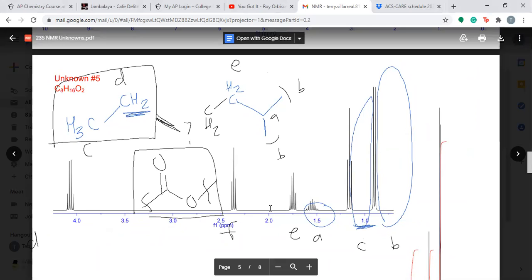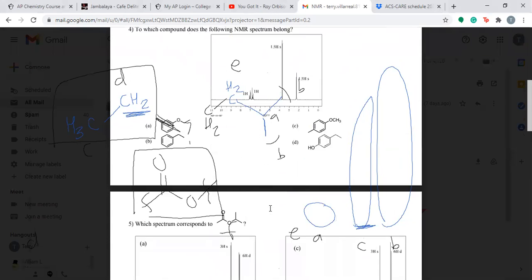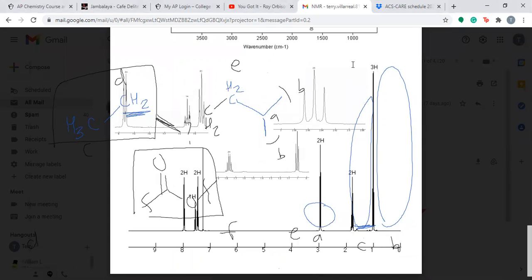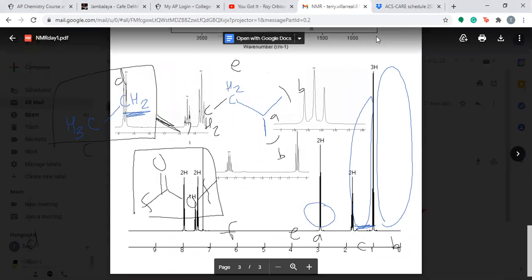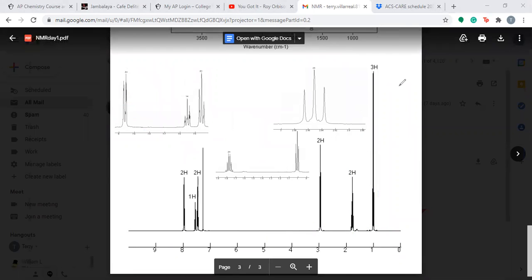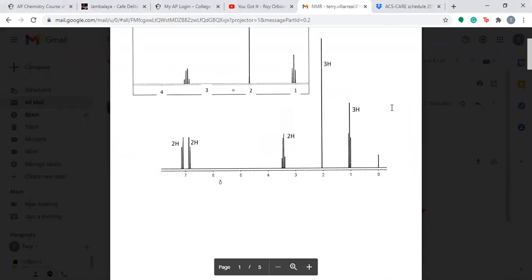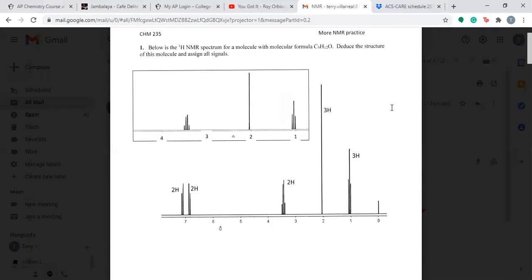Zoom out here. Here, I'm going to use this one as an example. Actually, this one's not a great one for seeing stuff right away, but come on. So, for example, this one here. Can you see any functional groups present in this molecule as drawn?